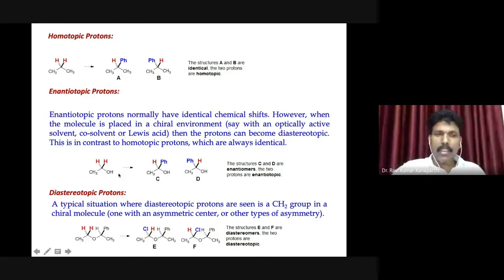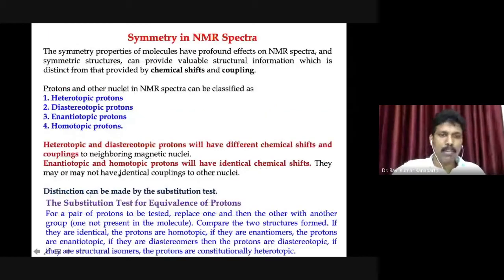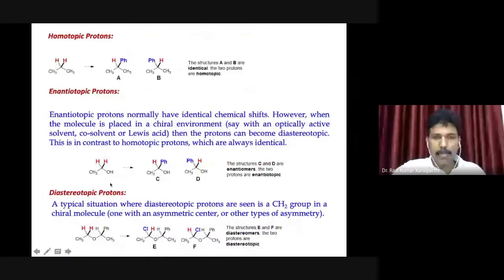Okay, and then the diastereotopic protons. Again, we can follow the same typical substitution test.